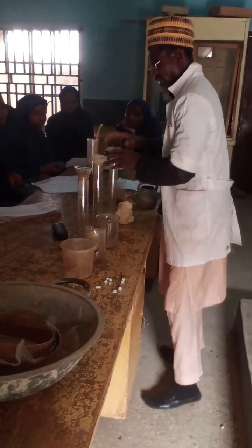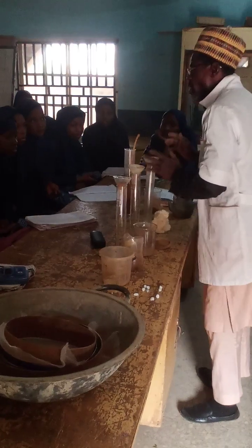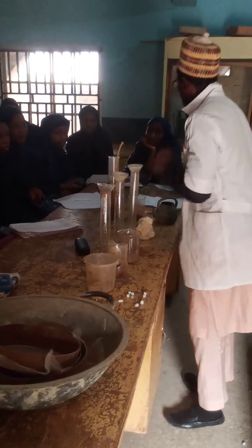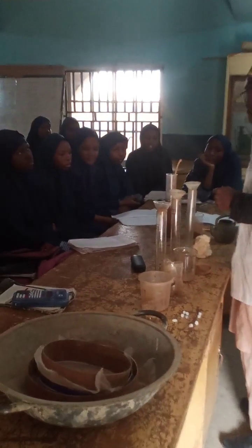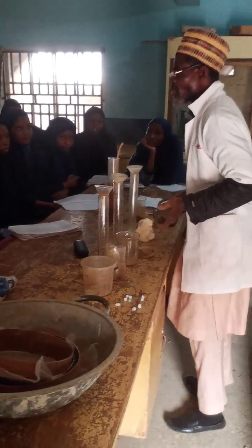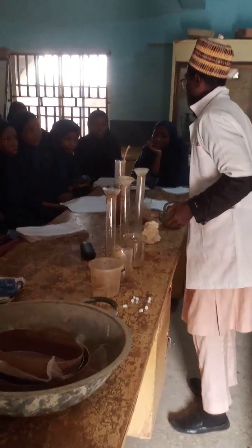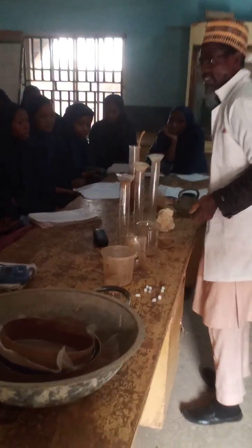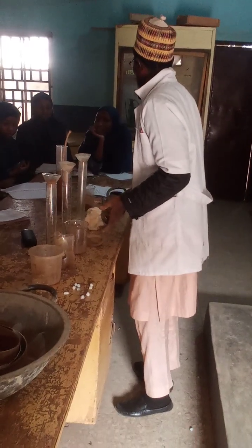Having put the different soil samples inside the cylinder, look at it, you want to know which one will drain water faster than the other. Is that clear? That's what's called soil porosity. If the soil is porous, you will know. If you pour water inside it, it drains faster. You can easily determine the type of soil it is. And if it's very slow in draining water, then it will be what?